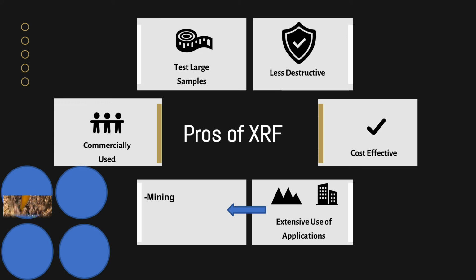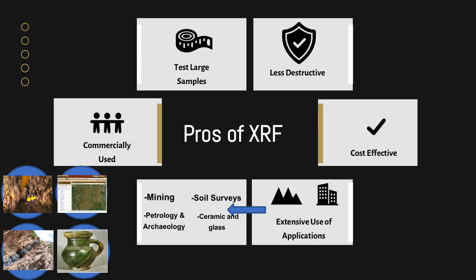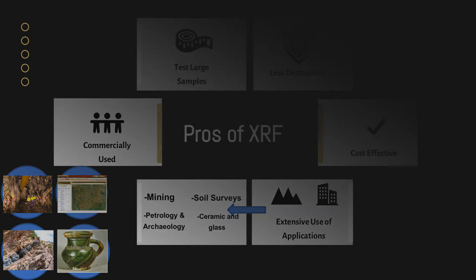Most importantly, XRF is used in a wide variety of applications, such as, but not limited to, mining and collection of various geological samples, soil surveys, igneous, sedimentary and metamorphic petrology, and in the field of archaeology, manufacturing and analysis of glass and ceramic materials.